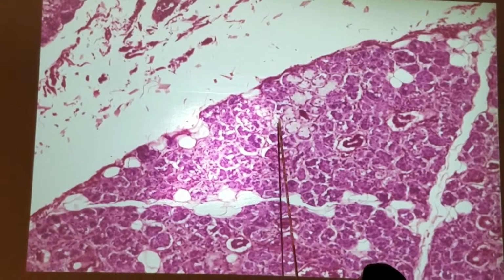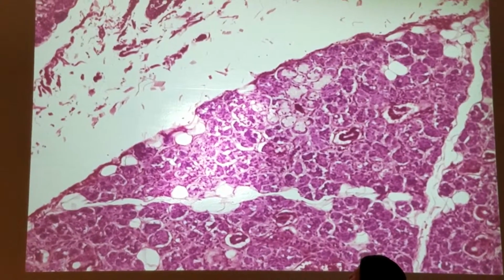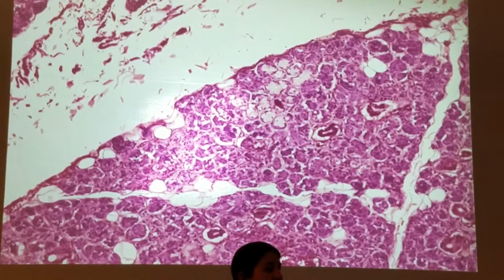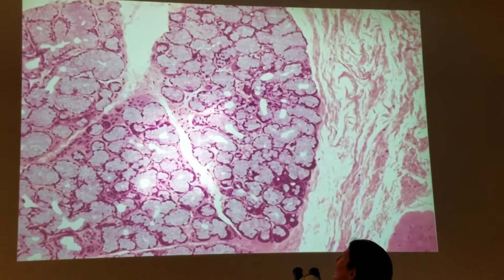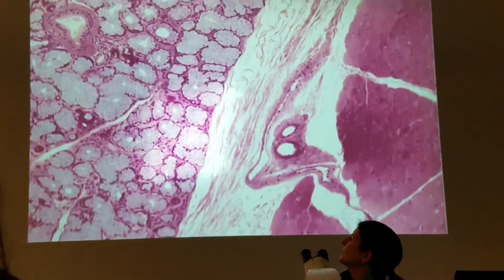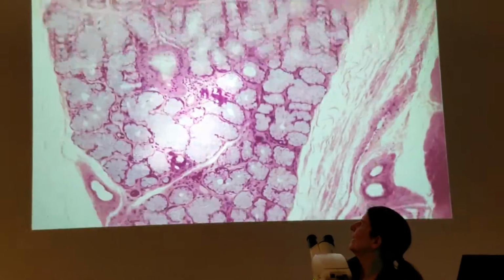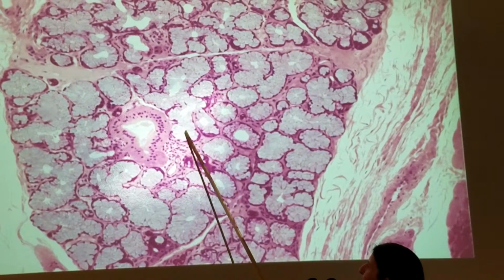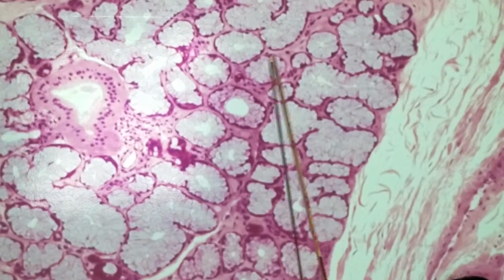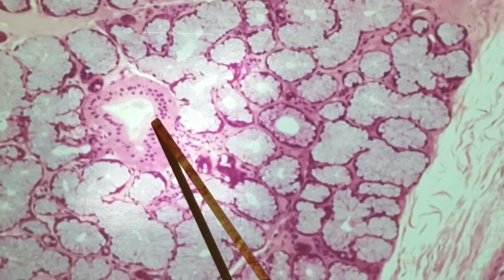So these are the mucous. Okay, so let me take a little tour. So sublingual. Not that there is not any serous acini, but again, it's not the majority. This time the majority you see here are mucous acini. So this is the mucous acini, up close and personal. A little bit better here. So these are all mucous acini. What is this? Duct. Salivary duct.